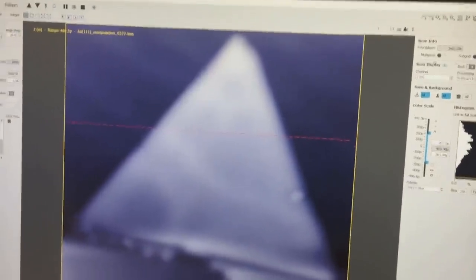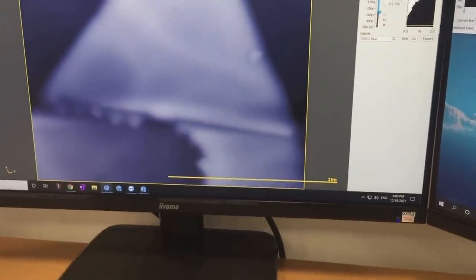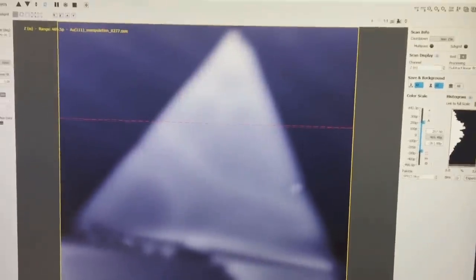So we spent some time trying to build structures atom by atom to contain electrons, and then realized, well, nature can do the job even better. And I don't have to spend a lot of time putting things together, moving atoms across the surface. So on this particular gold surface, we found this beautiful triangular structure. You can see the scale bar at the bottom, 10 nanometers. So it's about 10 nanometers on an edge, and it's pretty much a perfect equilateral triangle.